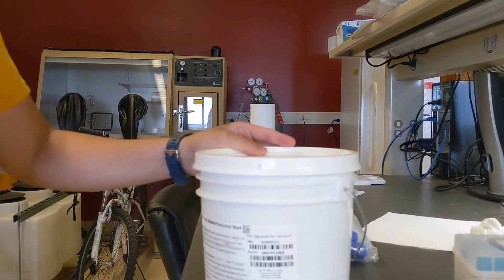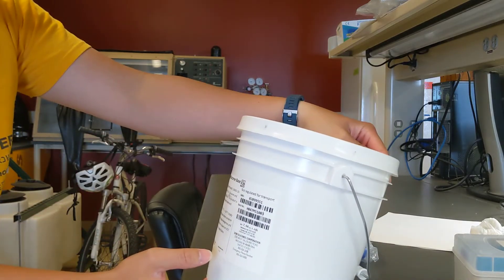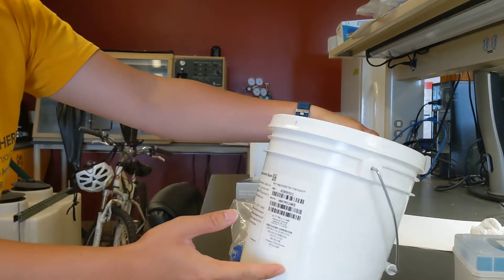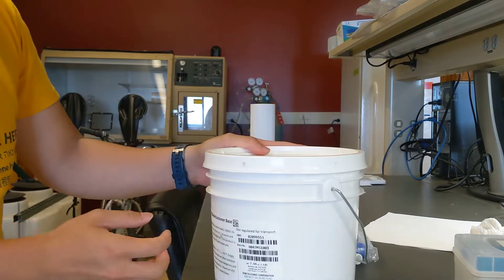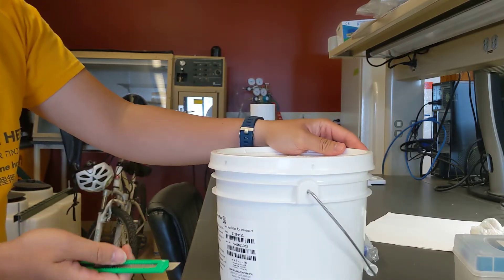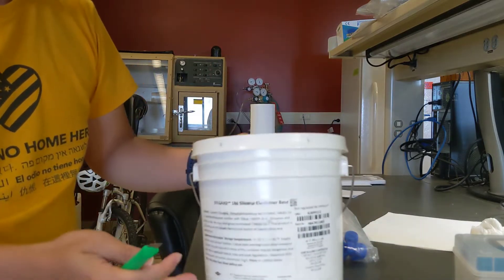Hello everyone. This is a PDMS Sylgard 184 silicone elastomer base. We usually purchase this from Dow, but this one is from somewhere else — it's exactly the same as the one we purchased before. Now I'm going to show you how to open this kind of big jar.